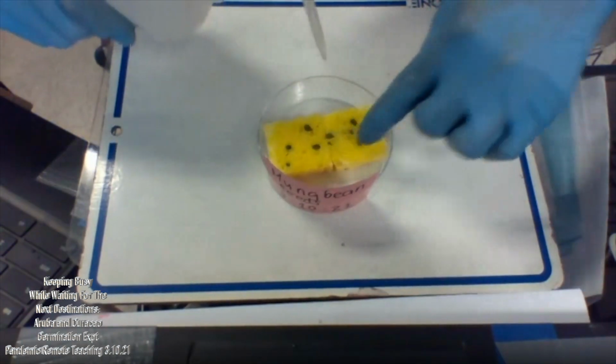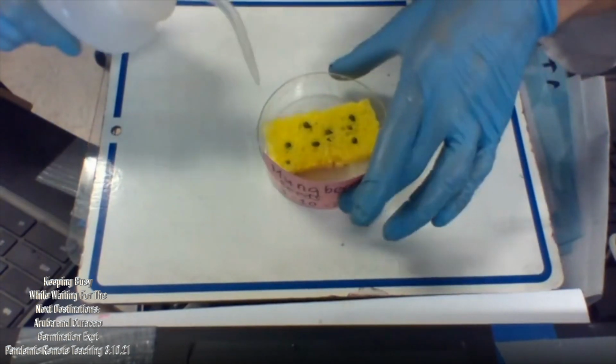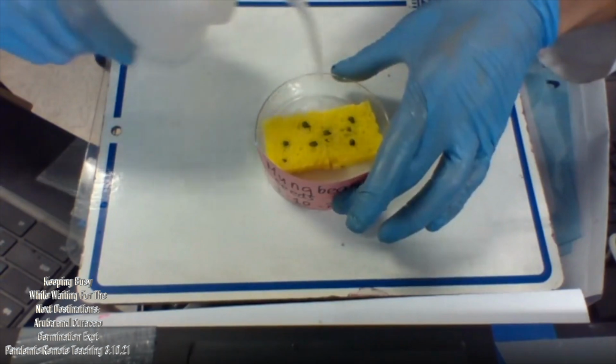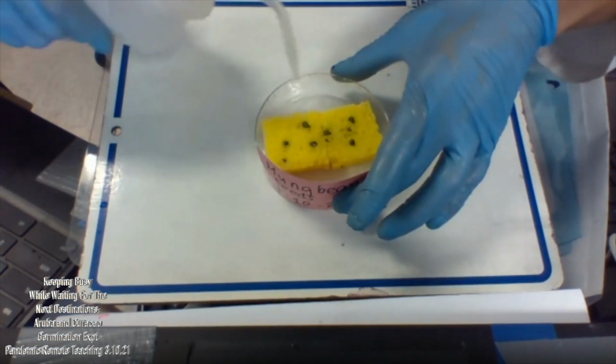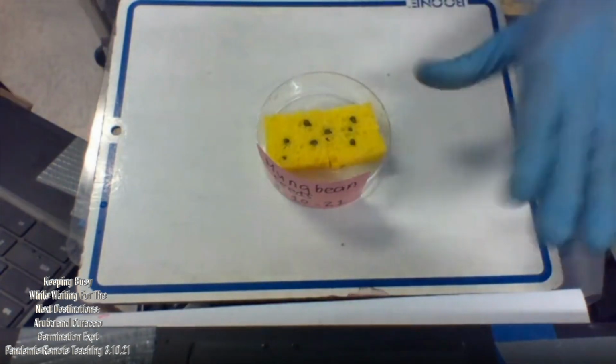Oops. So the sponge will keep the seed moist all the time, but not soaking wet. Okay. That is a setup. All right. In the setup that I did yesterday, I will show it to you once again.